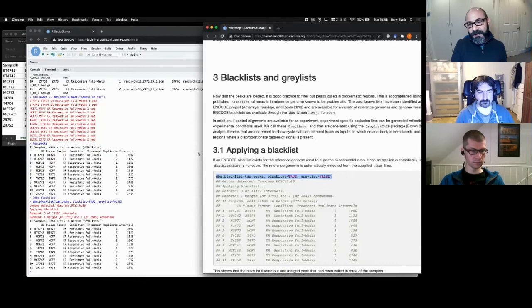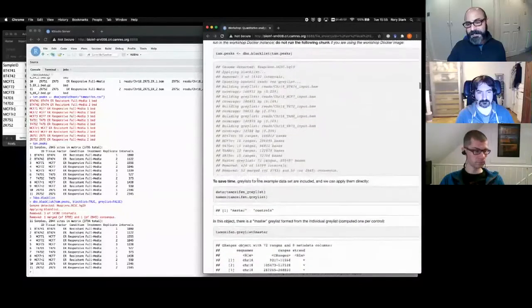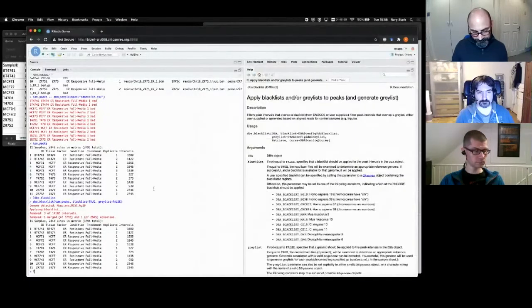So my co-author wrote a package called GreyListChIP. See if it can, if that's there.